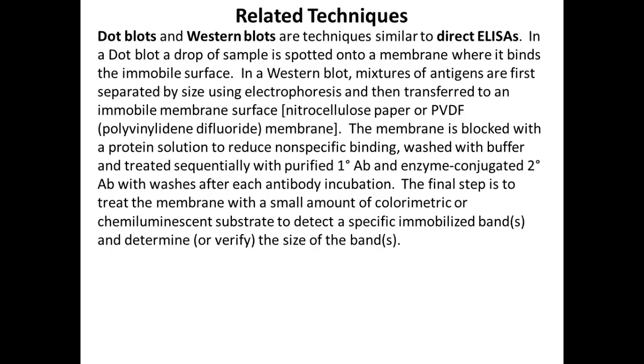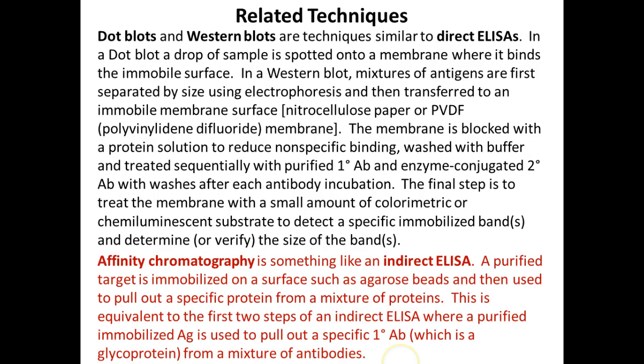These are some examples of different types of testing used in labs like Peter and I have worked in, where they're using membranes instead. A lot of times they'll separate out protein components with gel electrophoresis by size, and then embed them on a membrane. Then the antibodies are applied with enzymes or markers, so that we can actually visualize different bands on the plates.